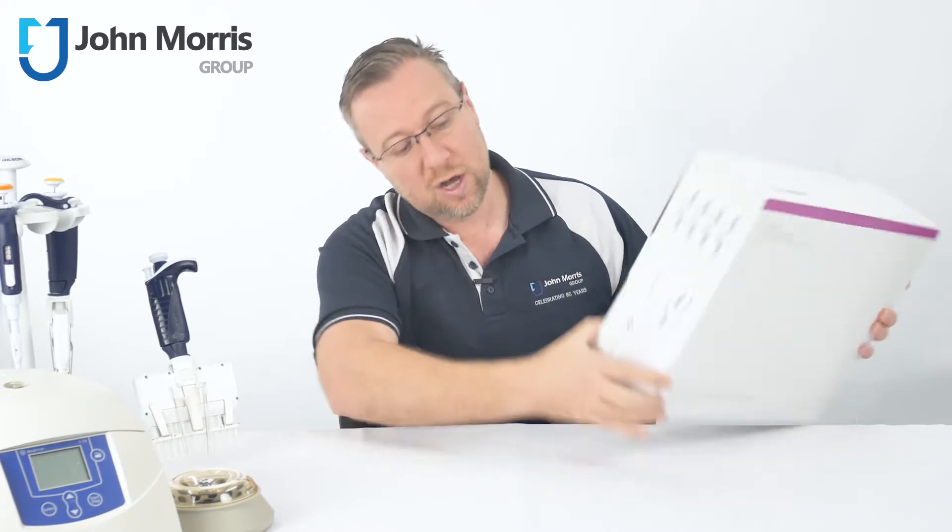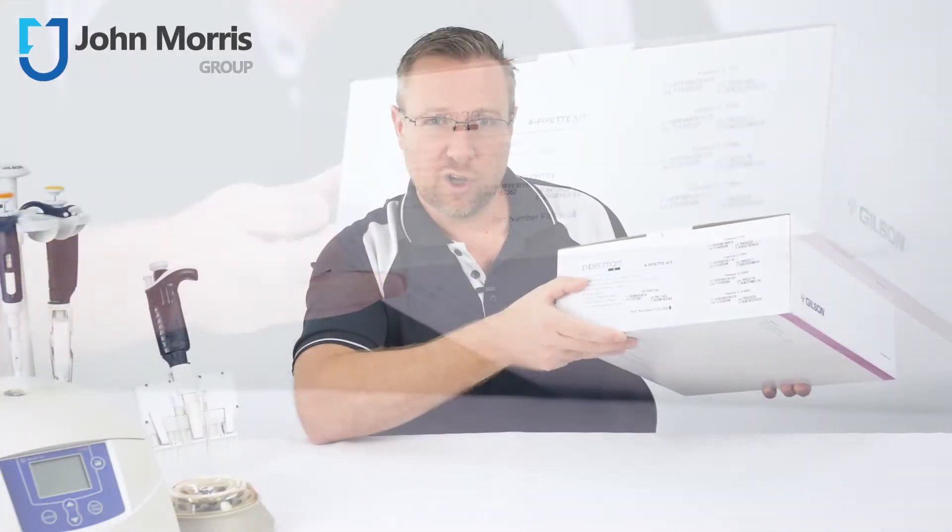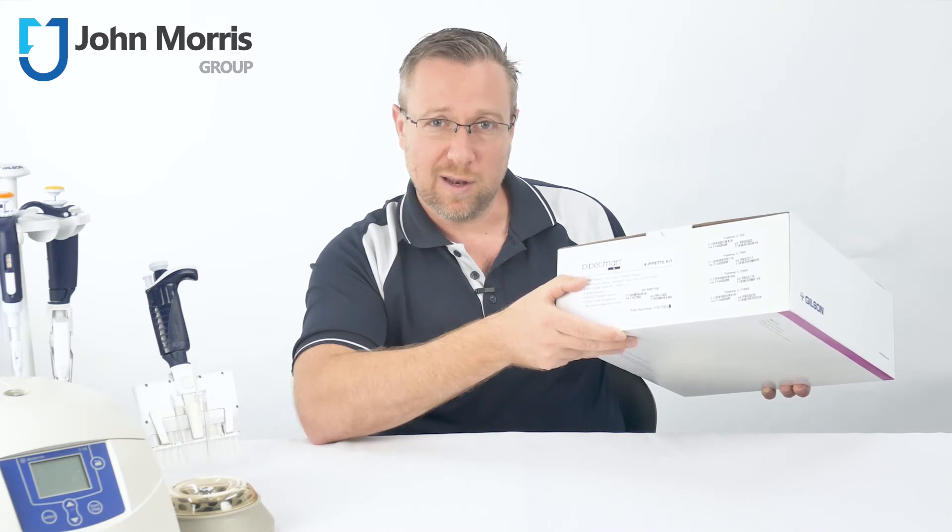There's also a list of all of the items which are included in the kit right here, but let's open it up and have a look at what you get inside the kit.